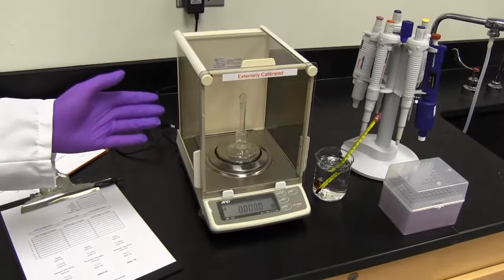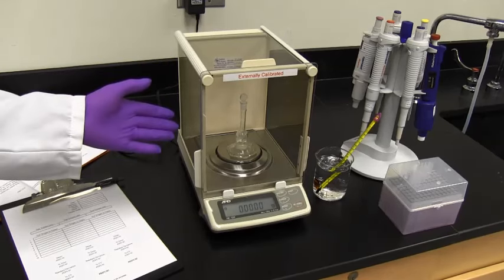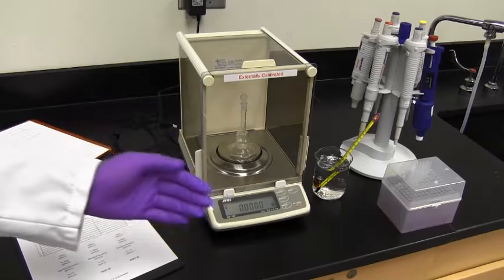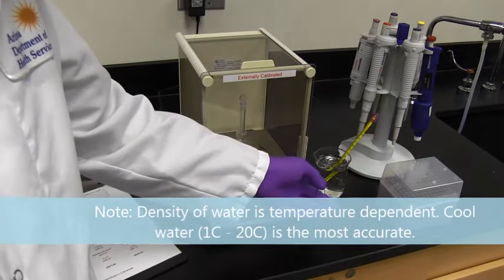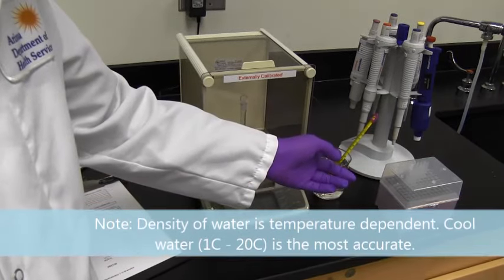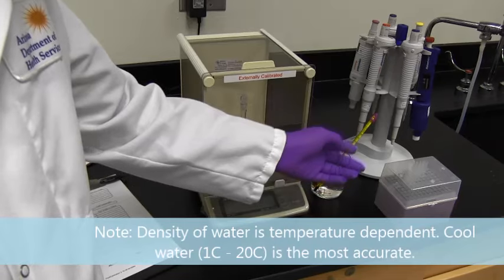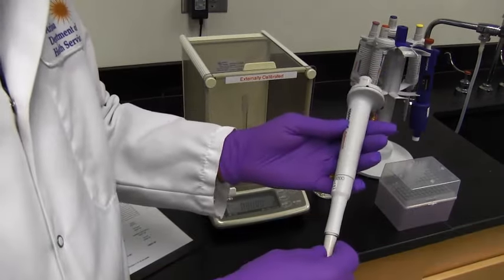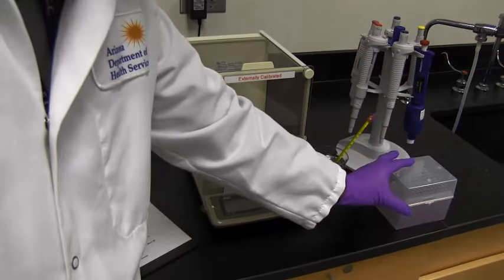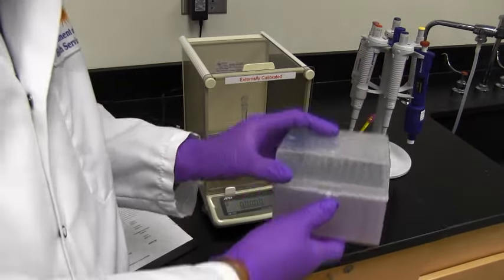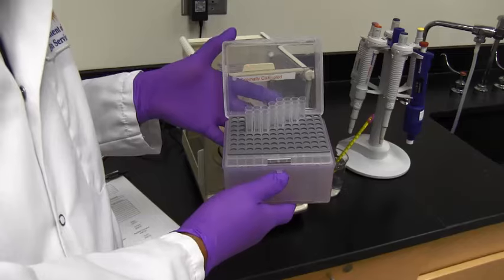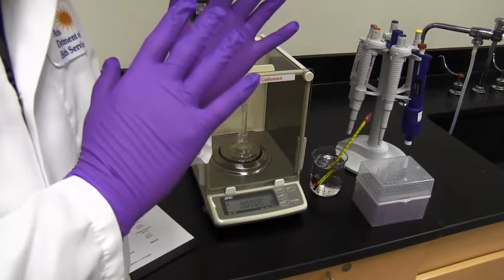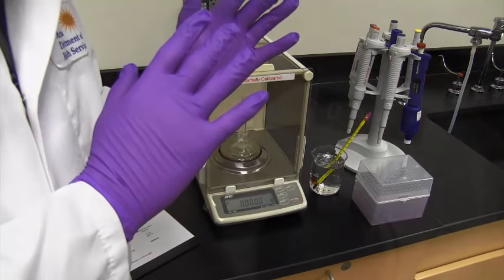You need an analytical balance. Our analytical balance has a volumetric flask inside of it. You also need a beaker with a NIST calibrated thermometer. You need the actual pipette itself. And then you need pipette tips. Lastly, you're going to need some gloves to handle all of this.